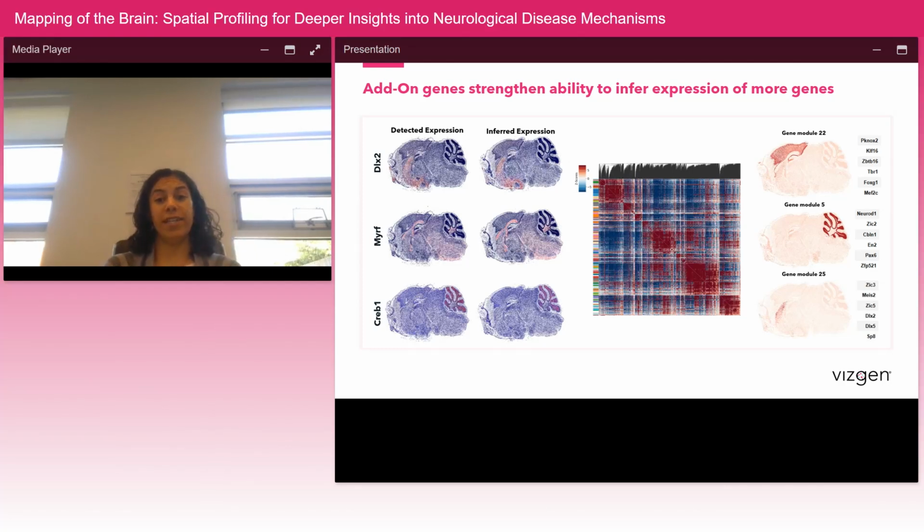And now with this larger data set, we can do bioinformatic analysis to identify genes that are co-expressed in different tissues spatially across the brain. The results of some of those are shown on the right. This is an unbiased look at what genes are lighting up the different regions within the mouse brain. This of course shows canonical markers, but it also shows genes that are expressed alongside those canonical markers and can be a nice tool to understand what could be additional functional targets or additional targets for drug targeting and so on. We repeated this process in 3 stages of mouse embryo.